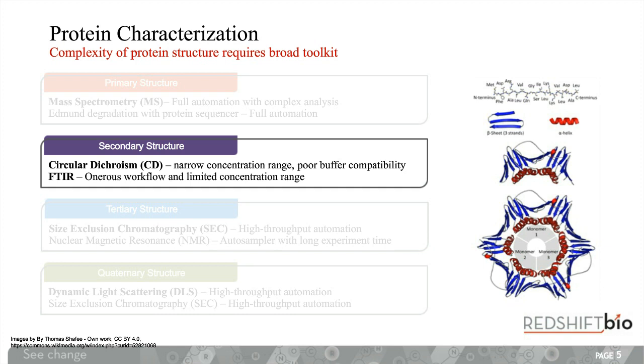Fourier transform infrared spectroscopy is perhaps a slightly better technique in this space because it gives you more information and gives you more signals that correspond to more types of secondary structures. It's also slightly environmentally sensitive in some cases. So the types of structures your secondary structures might be in may give different signals to others. For example, extended amyloid type fibrils or large aggregates will give a slightly different signal to antiparallel beta sheets that may be present within globular proteins. So this can give you that extra level of information.